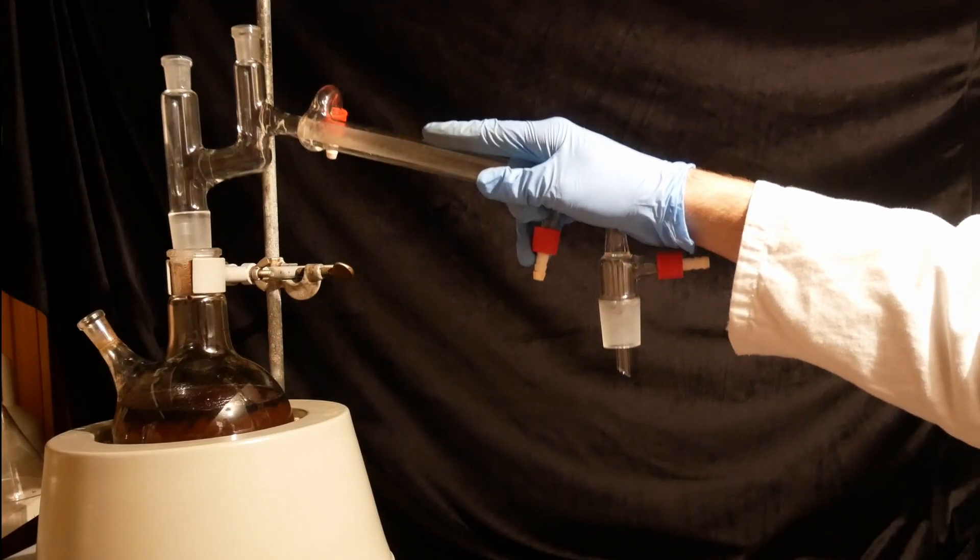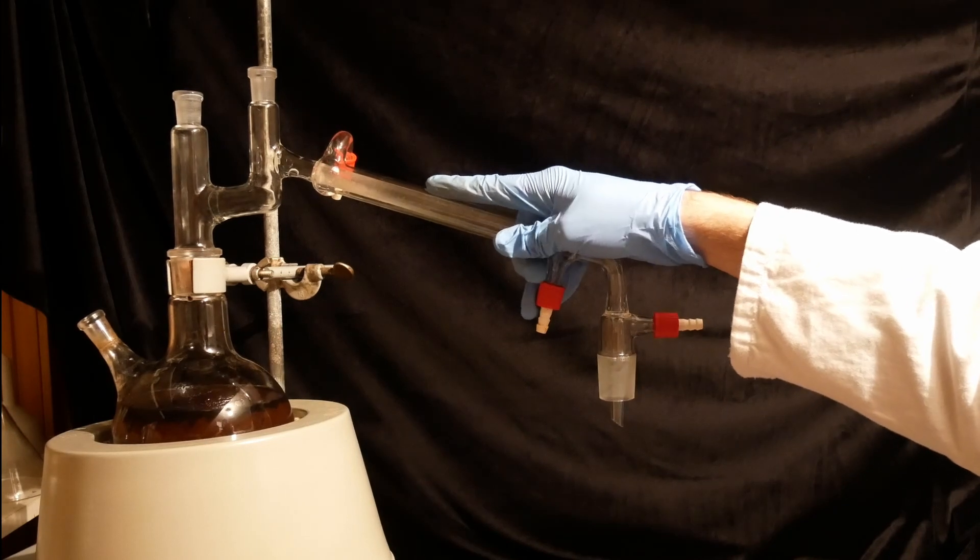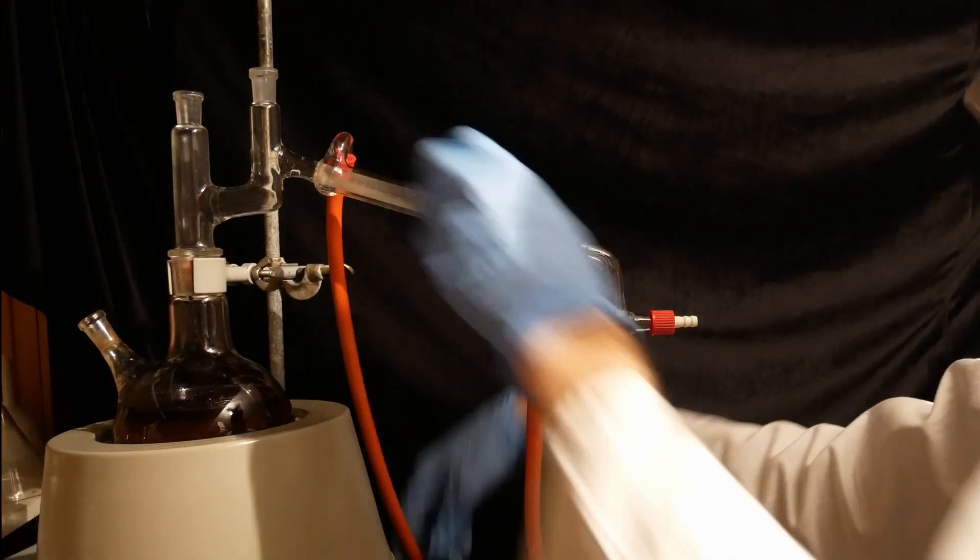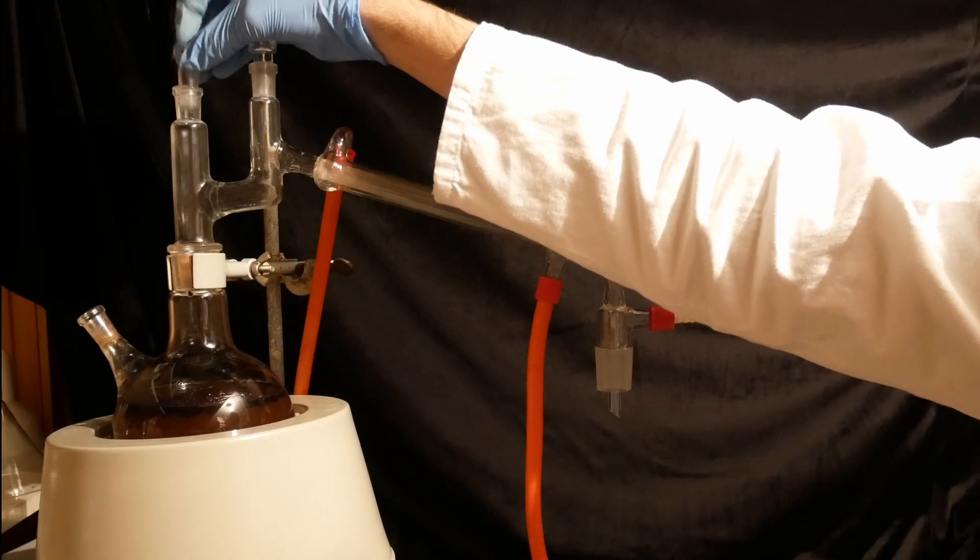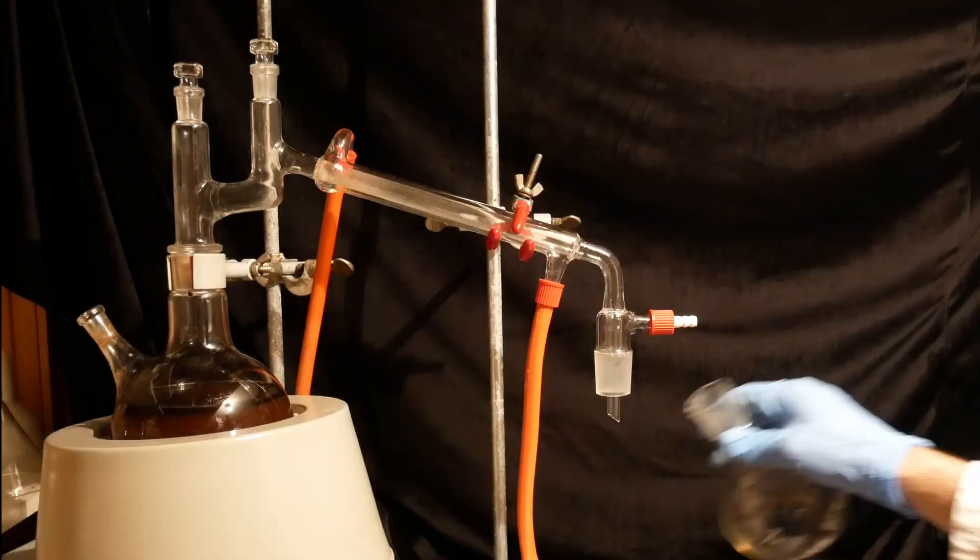Removing the aniline from the crude is quite simple, as it co-distills over with water, so I just assemble a simple distillation setup and boil the mixture to steam distill out the aniline.